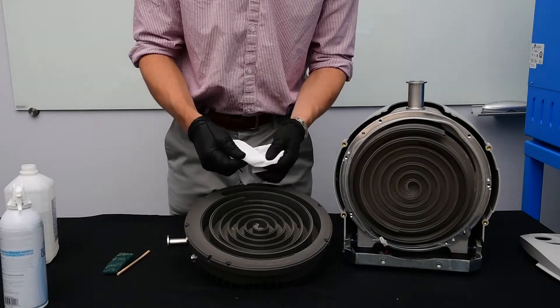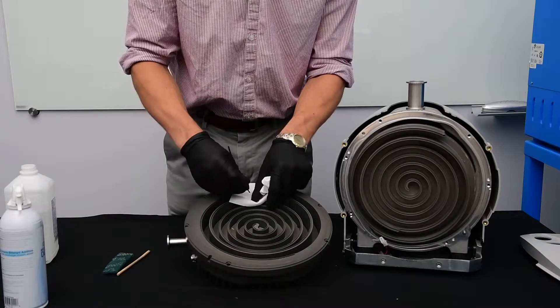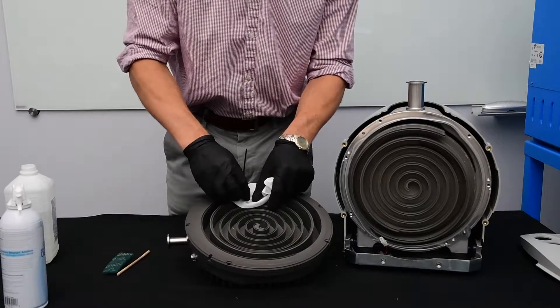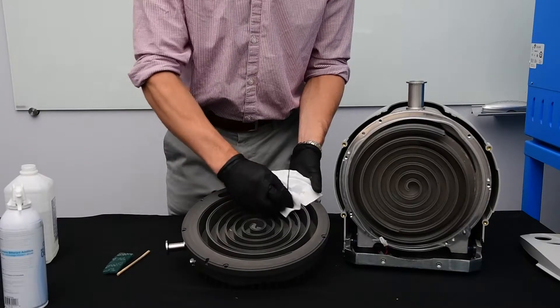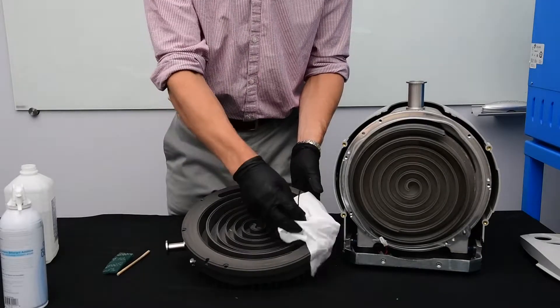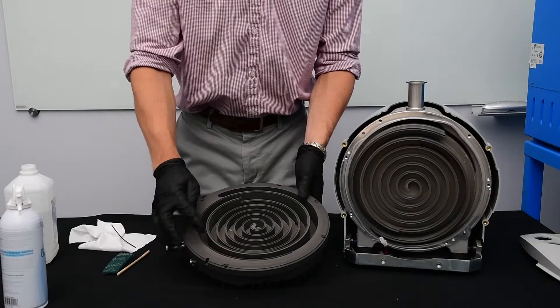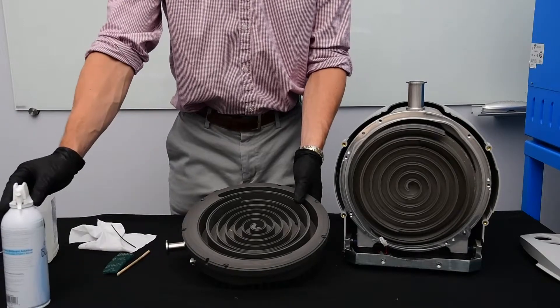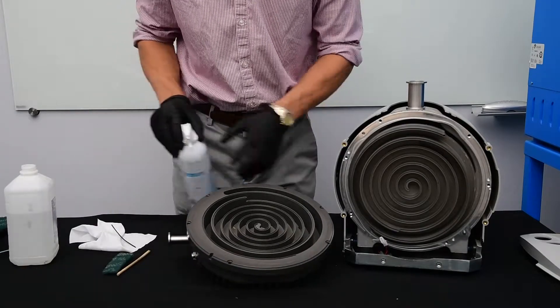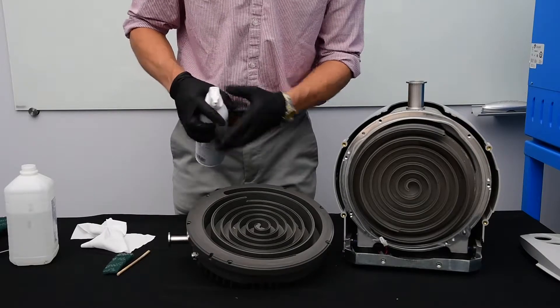And this is a lint-free cloth. You should be using a lint-free cloth — this is important, do not use paper towels or napkins. Now that the tip seal channel and groove is cleaned, we can spray it out with compressed air. This will help get rid of some of the residue and alcohol.